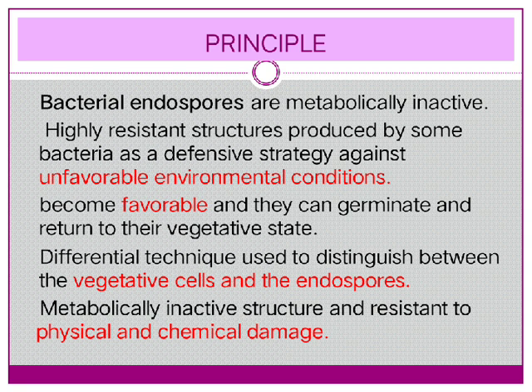Spore shape may also be of diagnostic use. Spores may be spherical or elliptical. Materials required: glass slide, inoculation loop, microscope slide, bacterial culture like Bacillus species or Clostridium species, malachite green dye, water, safranin, microscope. Prepare a smear of the culture on a clean slide.